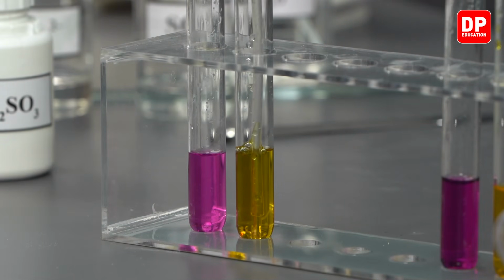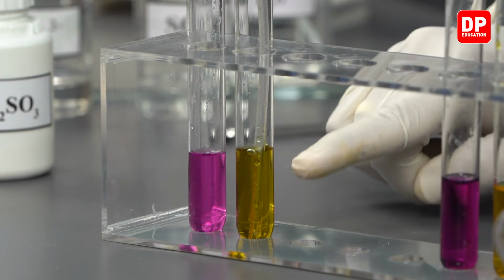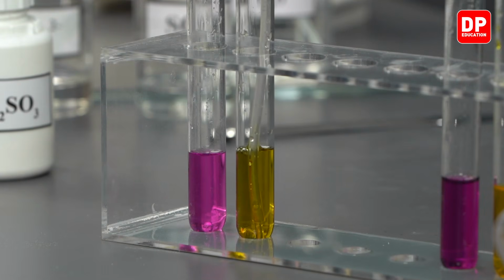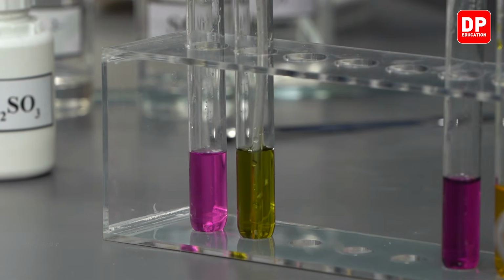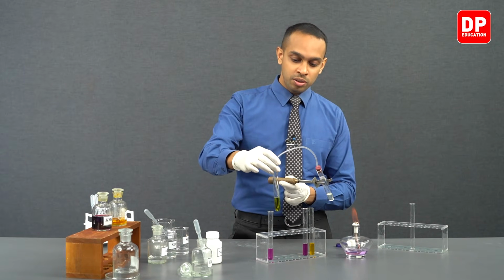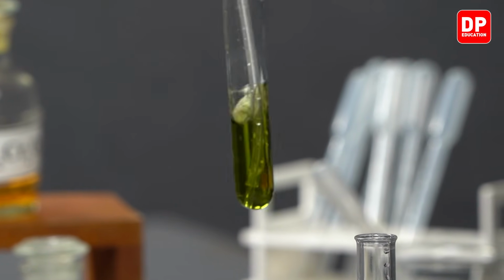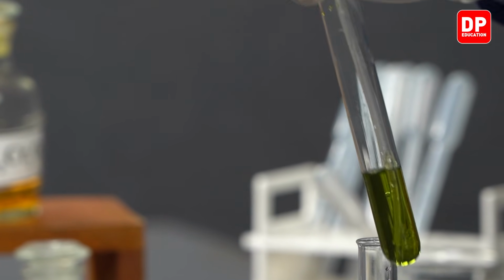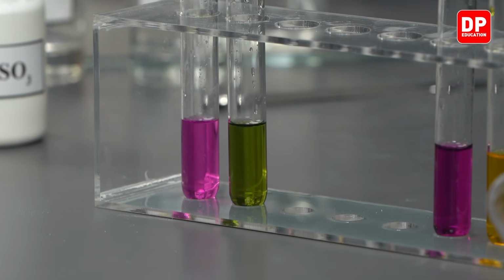As you can see, students, when we send the sulfur dioxide gas, the color gradually starts to change, and we can see it is now green in color. This green color observation indicates that the dichromate has turned into chromium 3 plus ions.